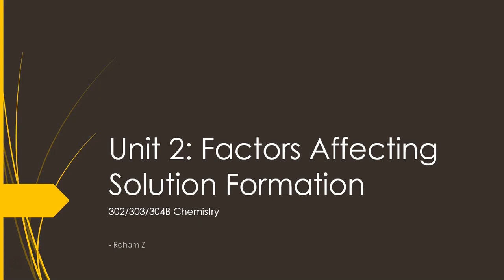This is for honors, this is for core, comprehensive if you have one. I don't know if comprehensive chemistry has one, but honors chemistry and core chemistry does have this lab. So basically it's going to be helping you out. And for me, I think it was pretty difficult.